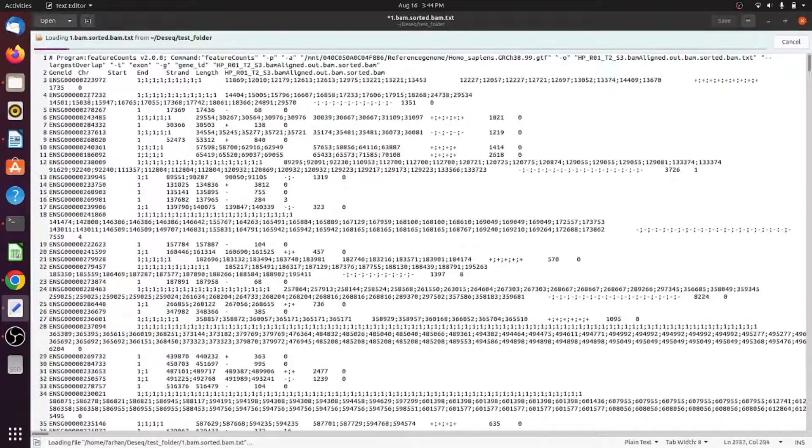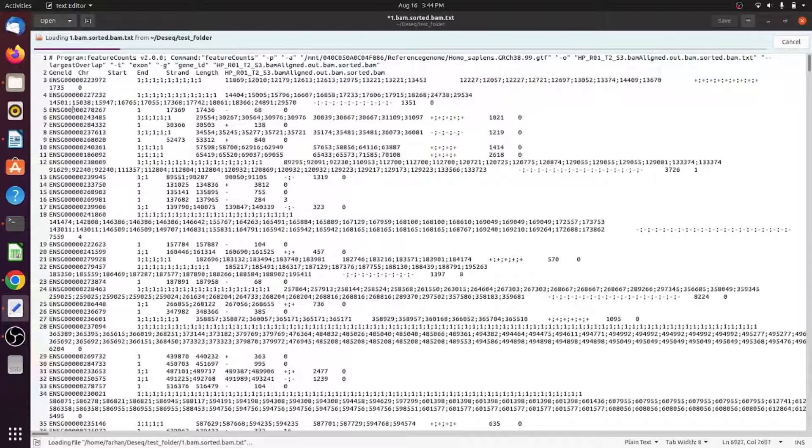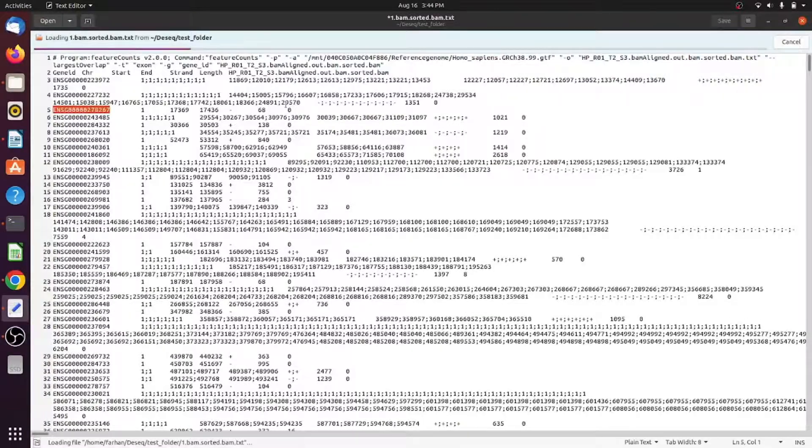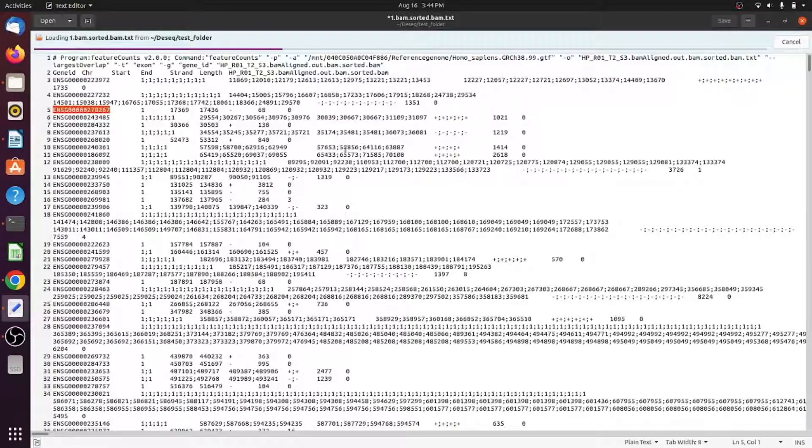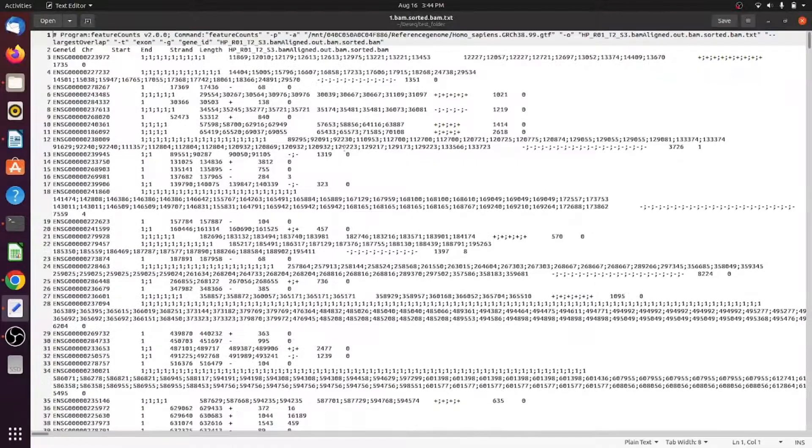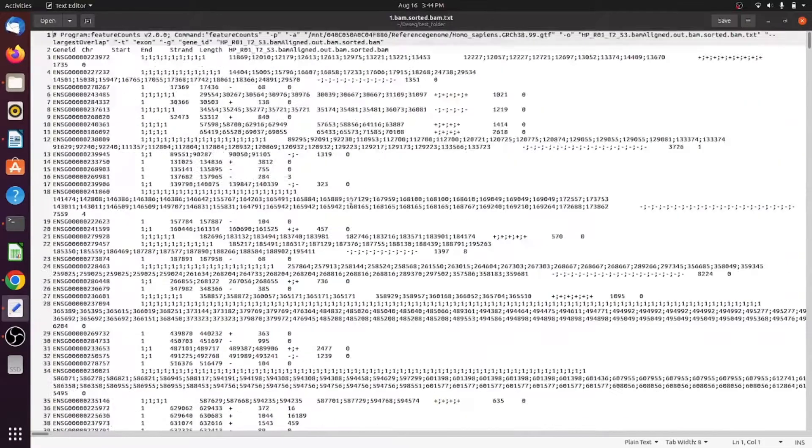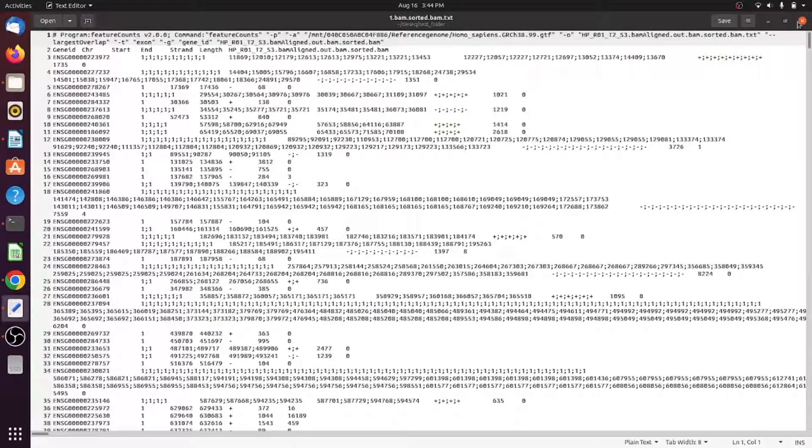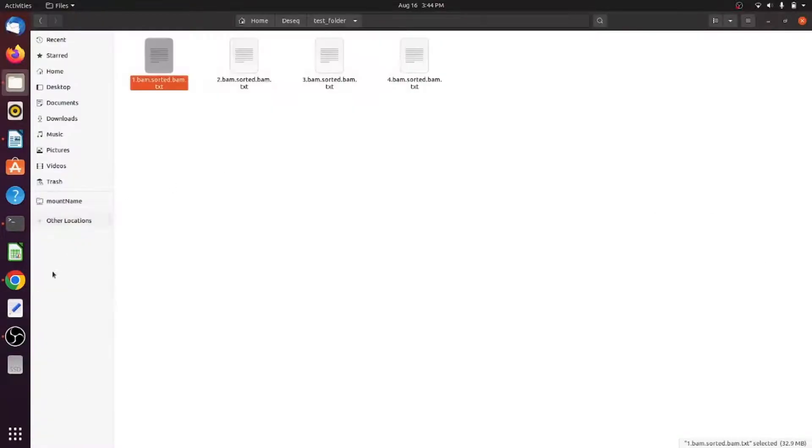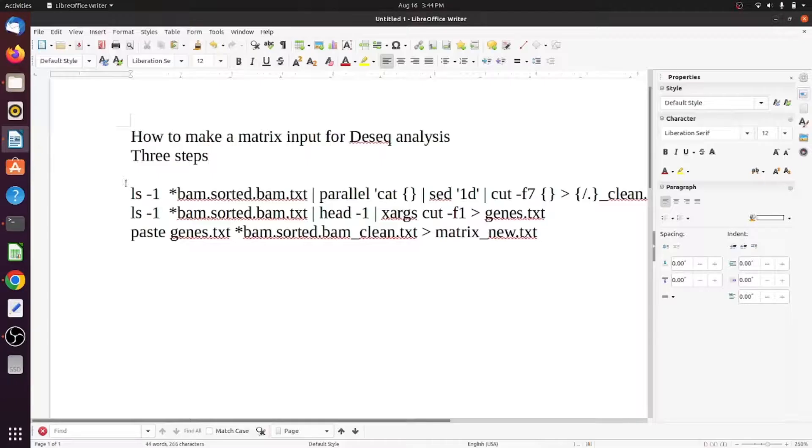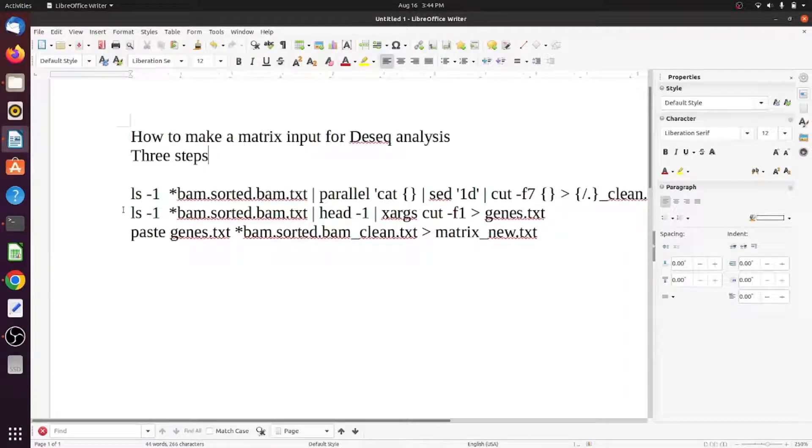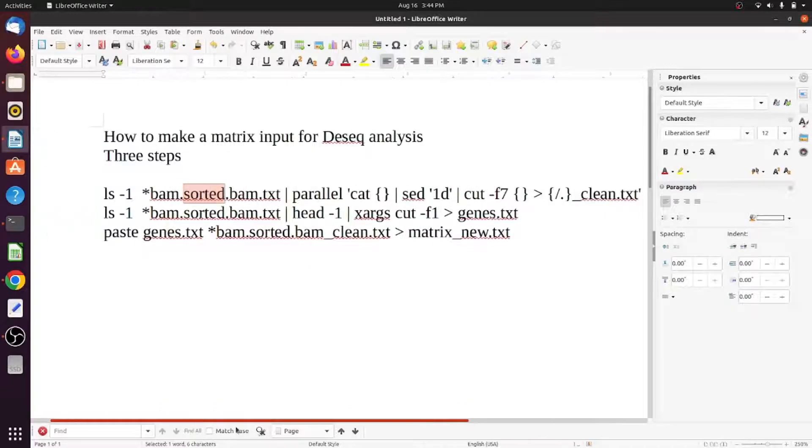This is just a test folder. There are four files. Each file has ensemble gene IDs and the feature counts and other details which you don't need when you perform differential expression analysis. You just need three commands.